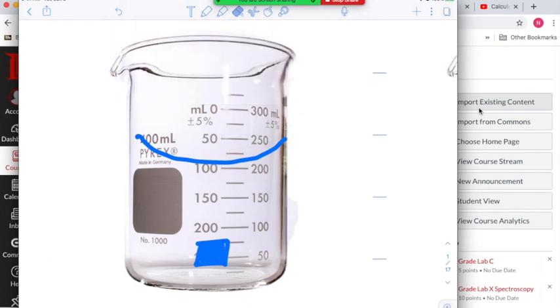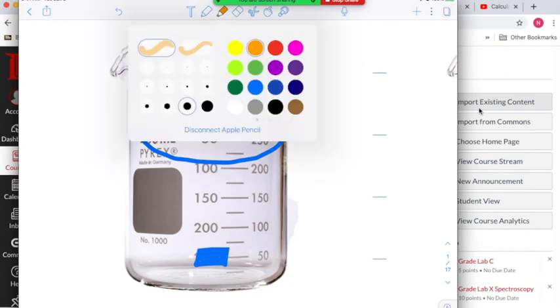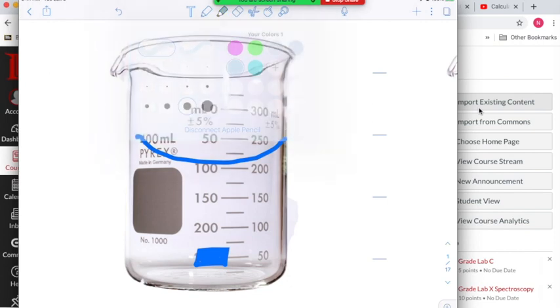Slightly soluble means what you might expect. Some of it can dissolve. So here, by erasing it, I'm going to say some of that is dissolving. And when that dissolves, because copper does tend to turn our solutions blue, or in this case a greenish blue, we're going to get a light blue.